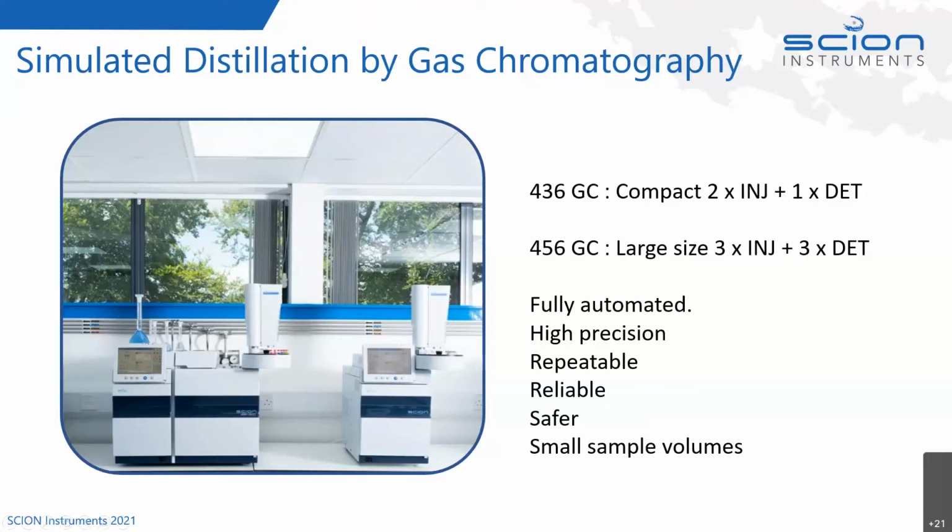So it's fully automated. There's high precision, high repeatability, very reliable. It's a lot safer. Small sample volumes are used; you could use 2 mil vials. So again, you've gone down from 100 mils to only 2 mil vials.